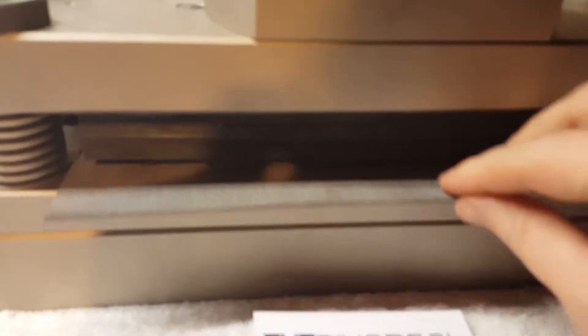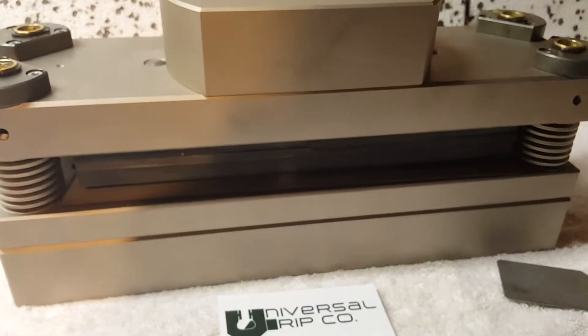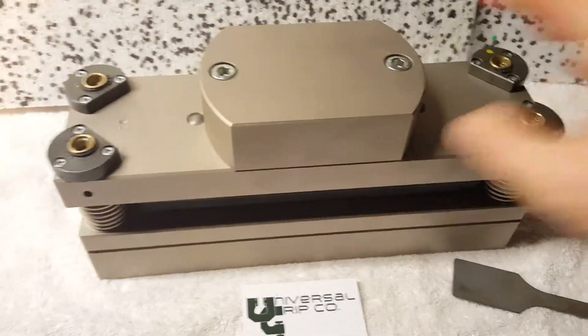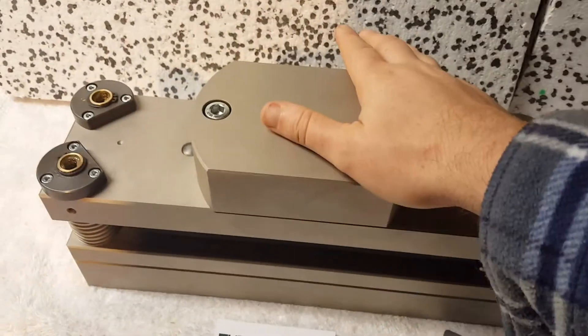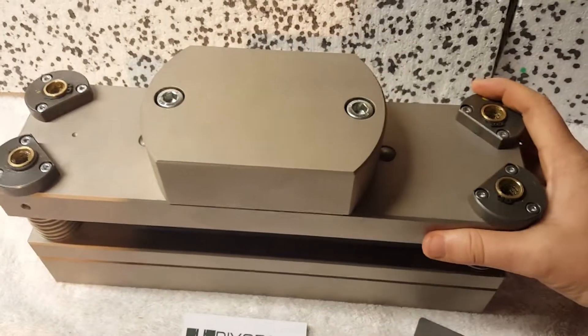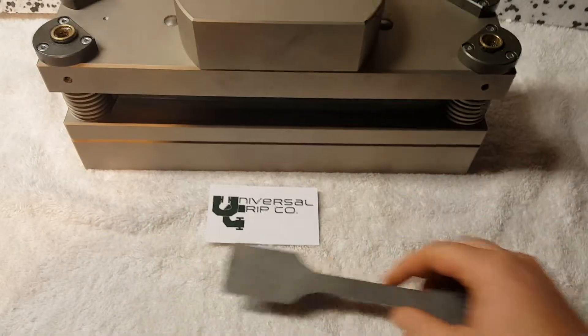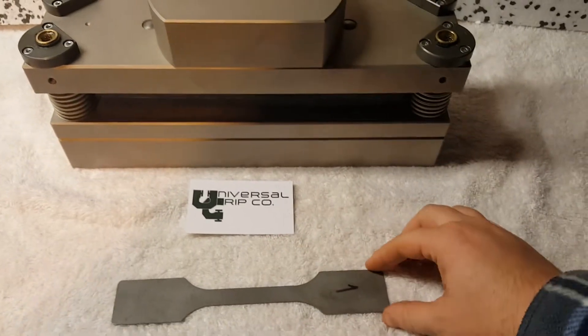This would be deposited into the die like this, and then the whole die would be mounted into a press — like a brake press or some other large pressing machine. It would come down, stamp the sample, and then deposit a standard sample such as this.